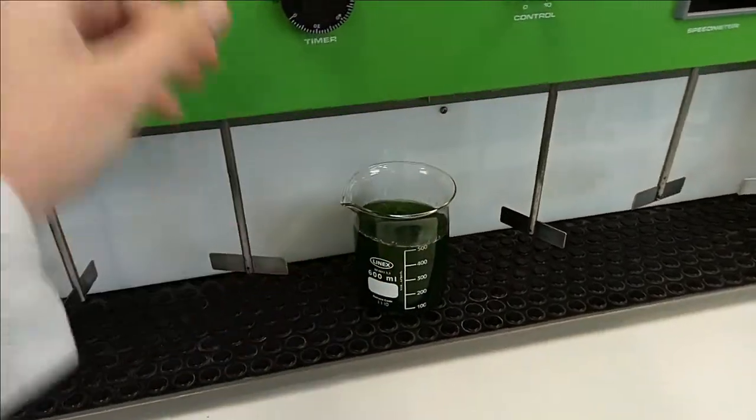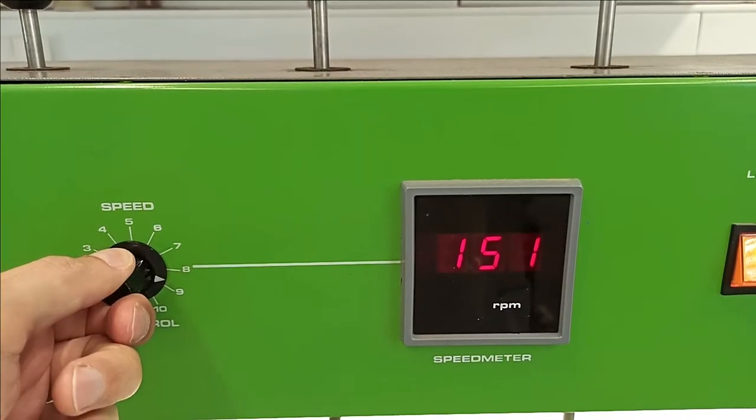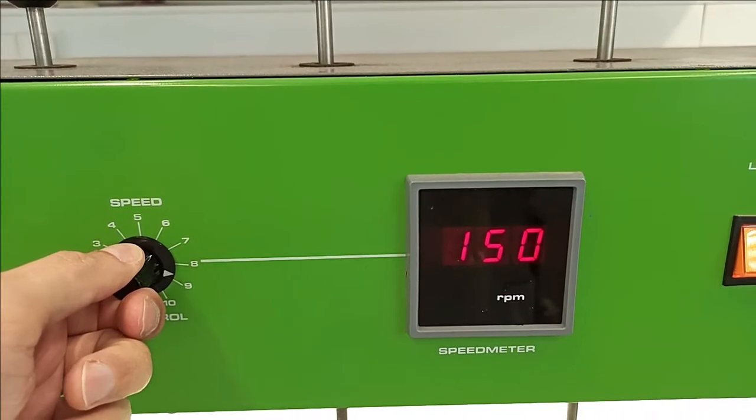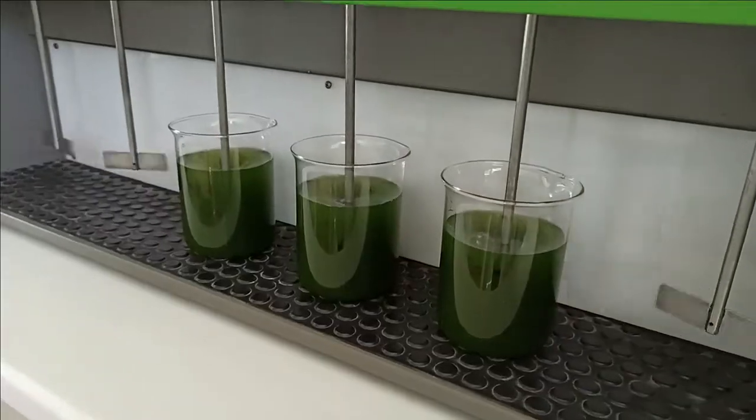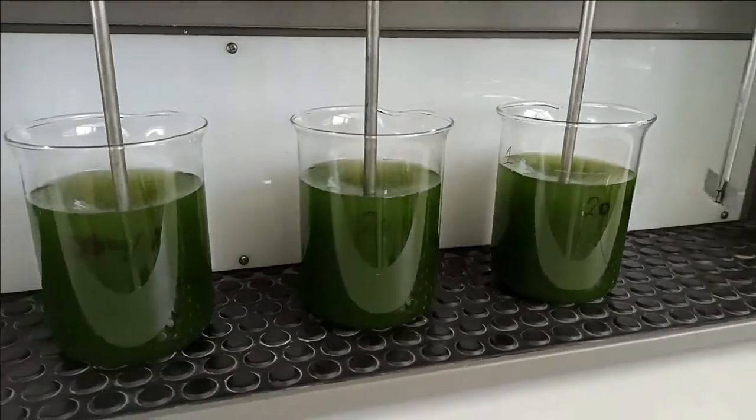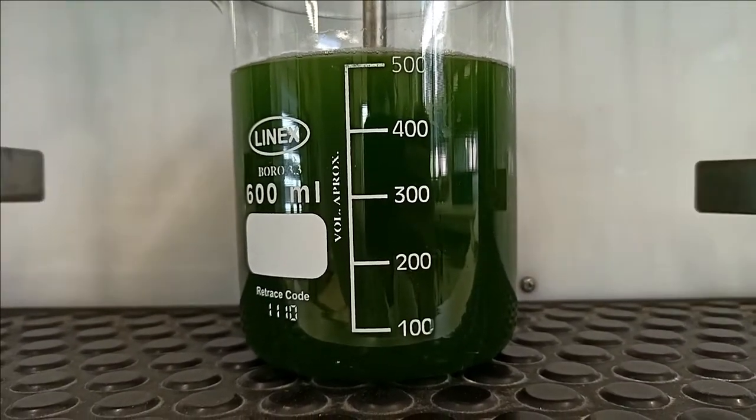The glass beakers are then placed in the JAR test and mixing set to 150rpm. The addition of the flocculant should be first followed by fast agitation to promote a good dissolution and dispersion of the flocculant.